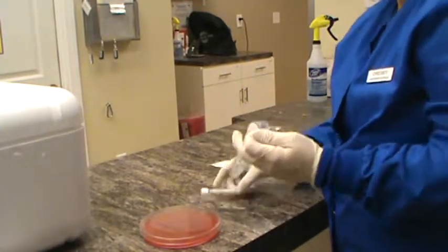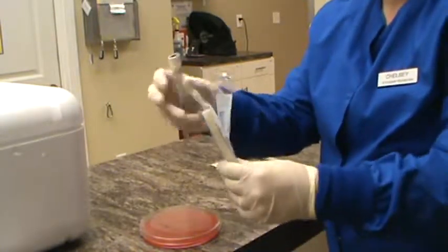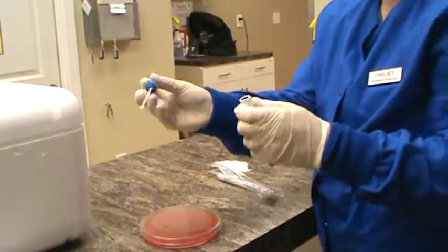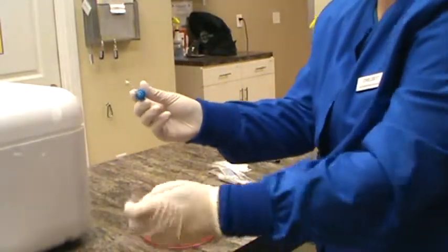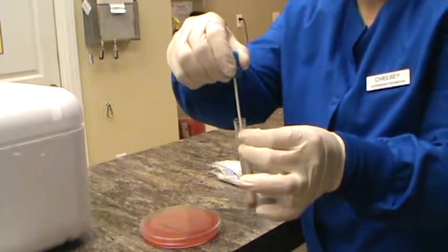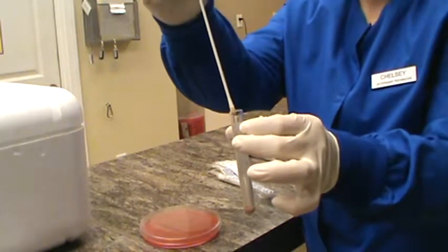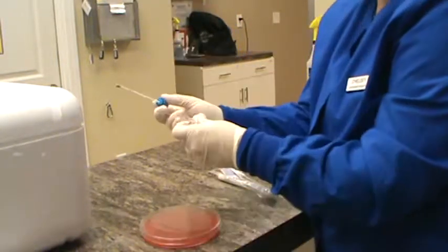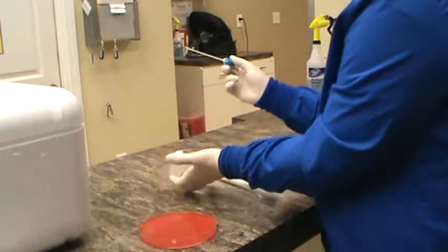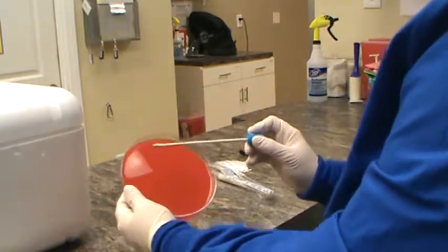We're going to open up our sterile swab, being careful not to touch it to anything. And then we're going to open our patient sample, like so. We're going to introduce the sterile swab into the patient sample, and then recap it here. I'm going to open up our agar plate, and we're going to begin inoculating the agar plate.